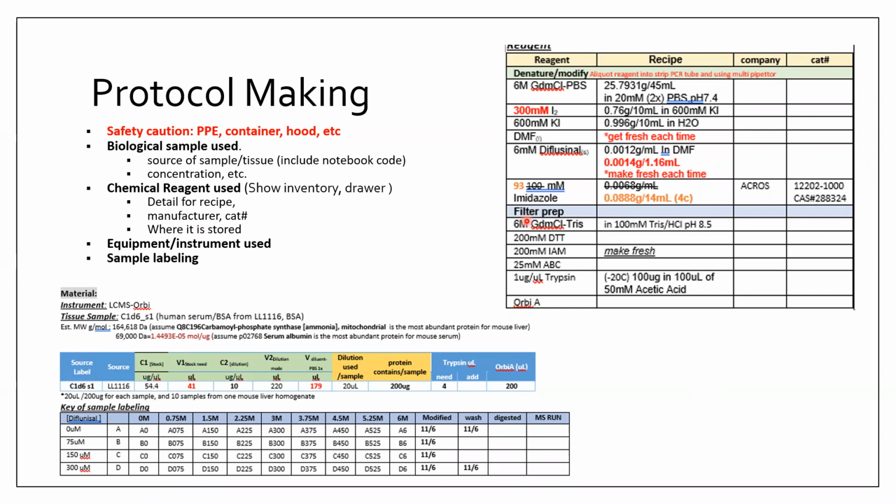The idea is you want to include as much detail as possible so somebody else can reproduce what you do easily.